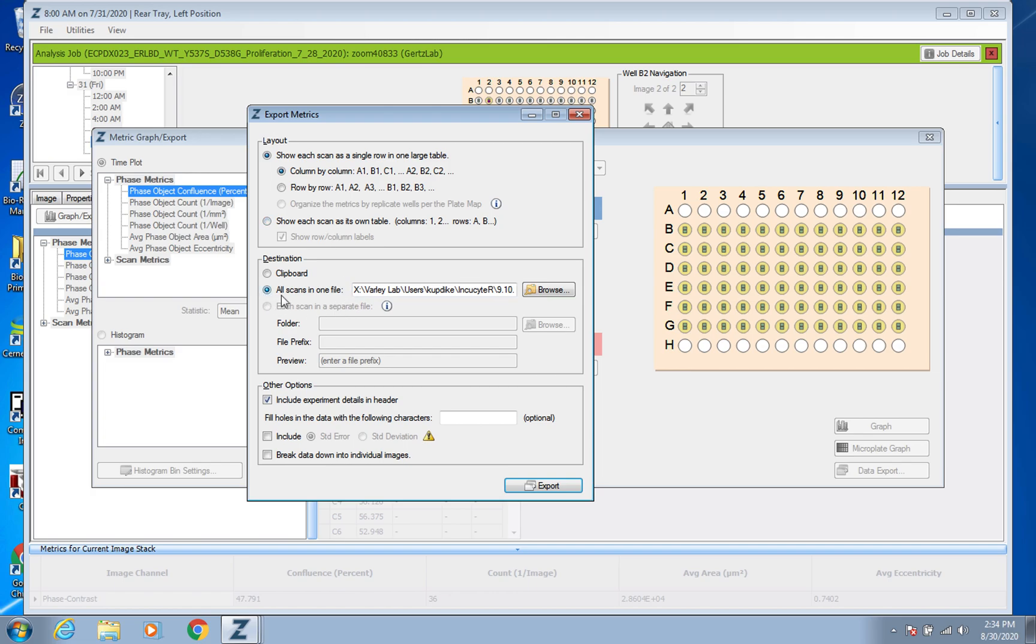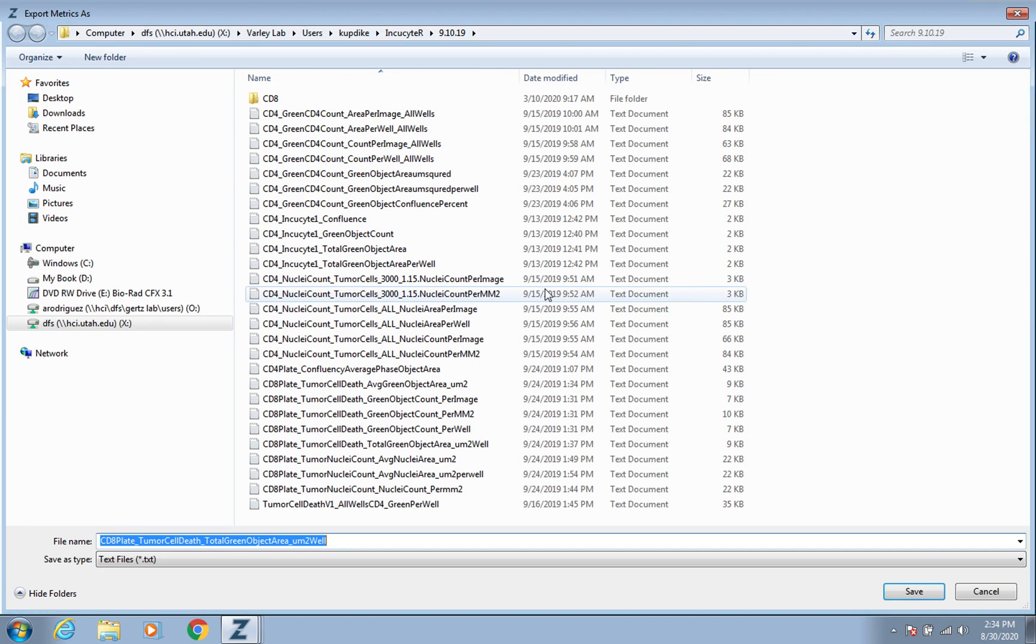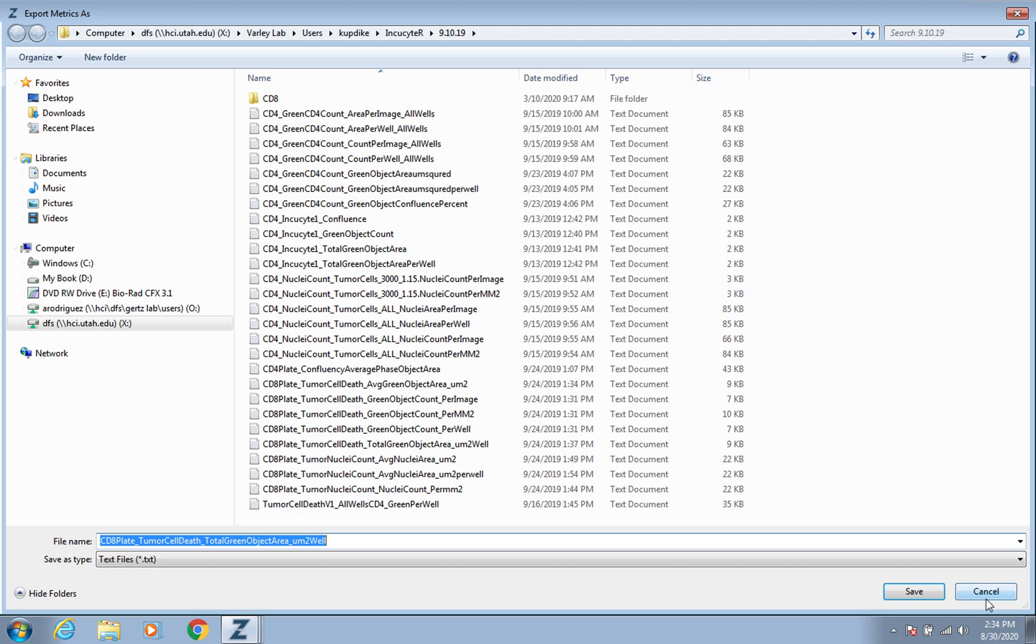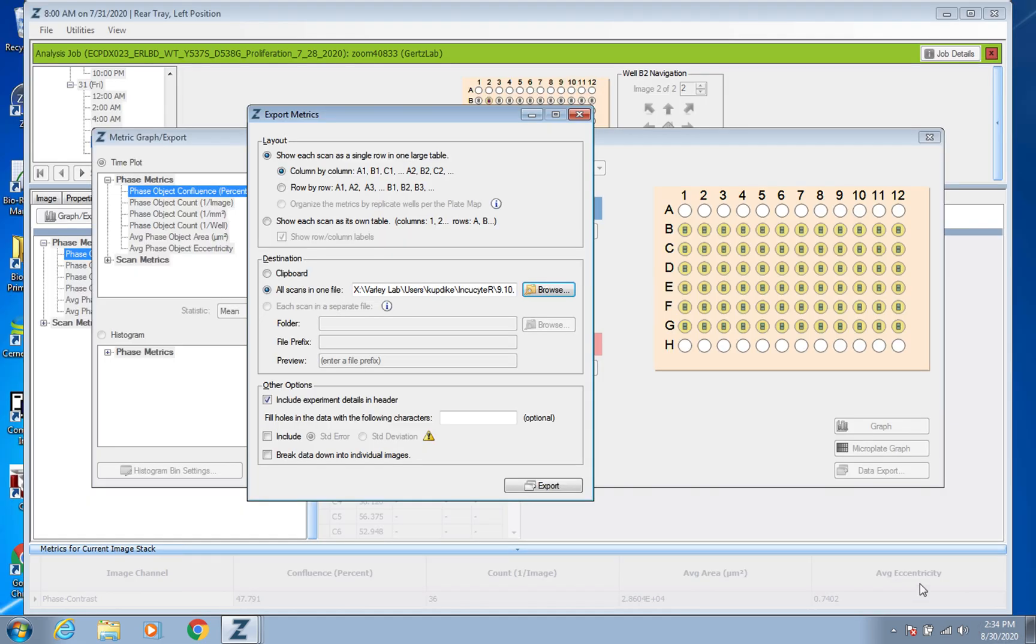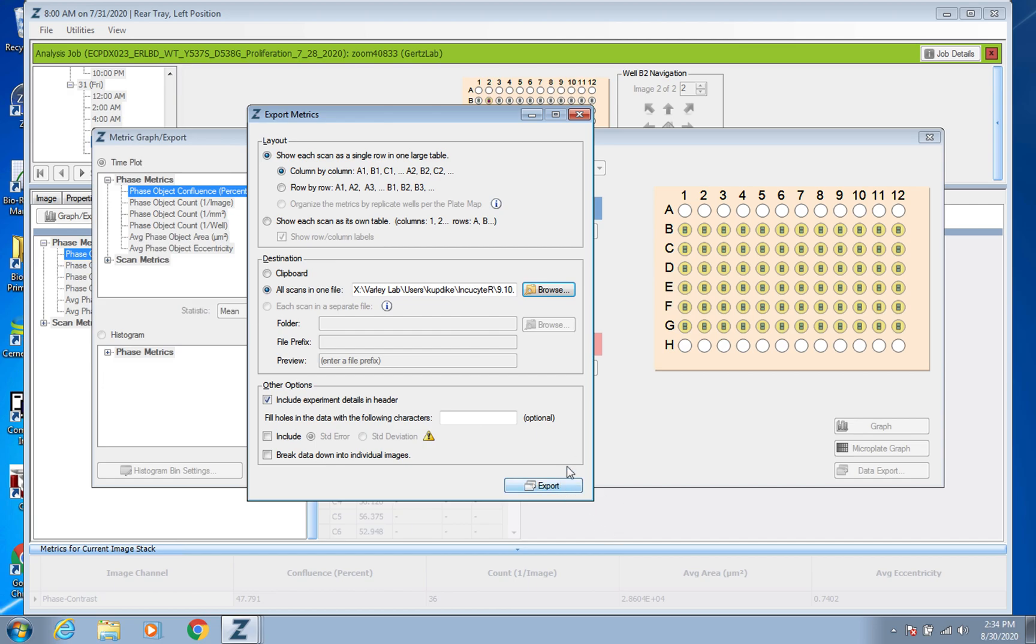And then here it's just All Scans in One File, and of course just Browse. Normally I've got a flash drive attached to the computer and I would save it onto there. How you like to save things and name things is totally up to you. I don't normally include any of this, so and then you would just press Export.